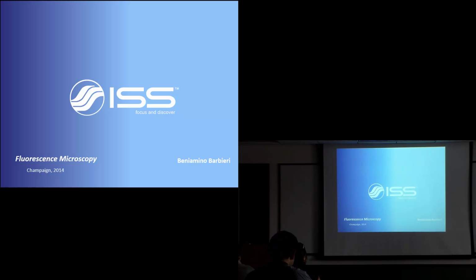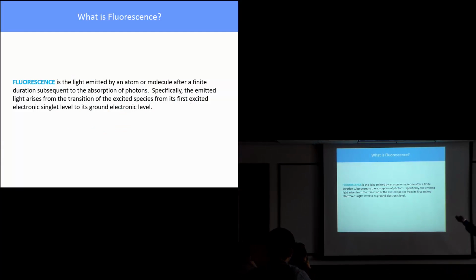No. Okay. So yesterday we started talking about fluorescence. Today we will talk about the application of fluorescence to microscopy, which goes under the general name of fluorescence microscopy. How many of you are using or working with a microscope? Several, great, very good.